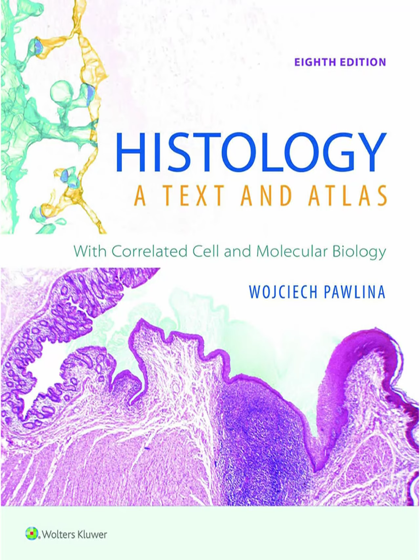Exactly. And one more, which is quite different: atomic force microscopy, or AFM. Atomic force, it sounds intense. It measures tiny forces. It's unique because it's not optical or electron-based at all. It uses an ultra-sharp physical probe, like a tiny record needle, but much sharper, attached to a flexible cantilever. This probe literally taps or drags across the surface of the specimen. As the probe encounters bumps and valleys on the surface, the cantilever deflects. A laser beam reflecting off the cantilever measures this deflection with incredible precision, allowing a computer to map the surface topography. It feels the surface, down to atoms.